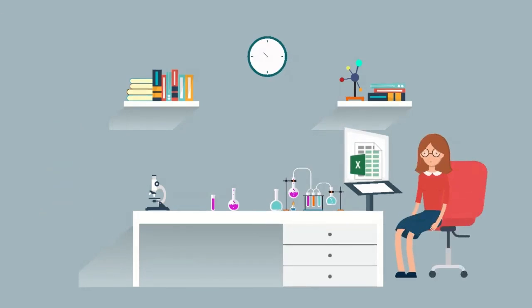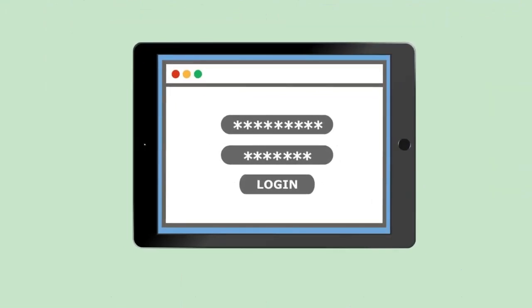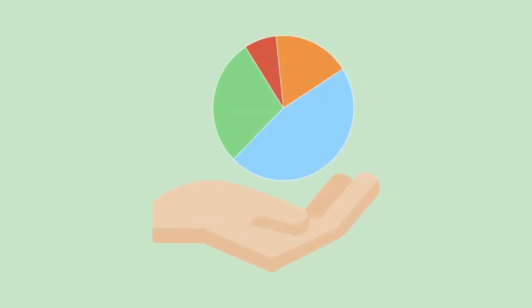Suppose you're struggling with finding your chemicals in the lab because you only have an outdated spreadsheet. In that case, this video walks you through exactly what you need to do to create an easily updatable and searchable digital database, making your chemicals much more accessible.